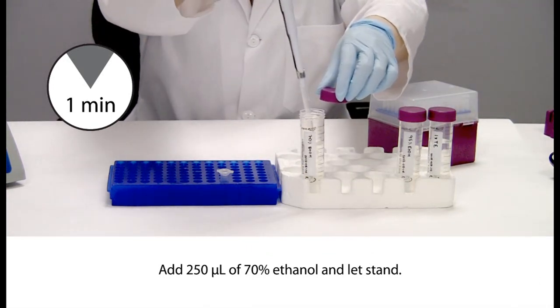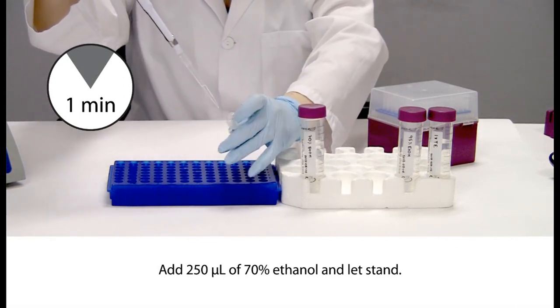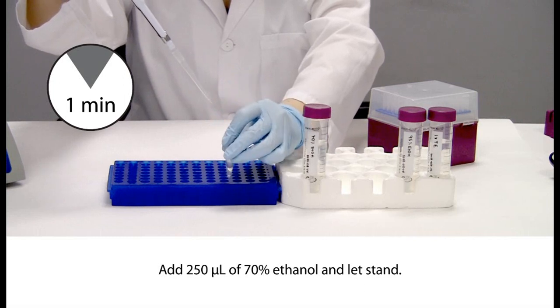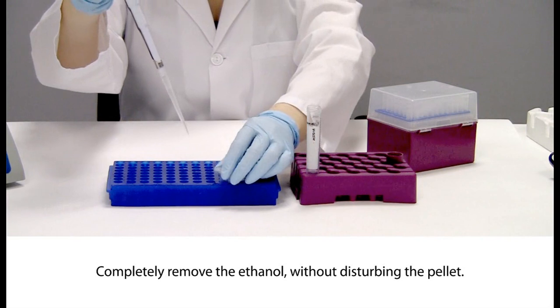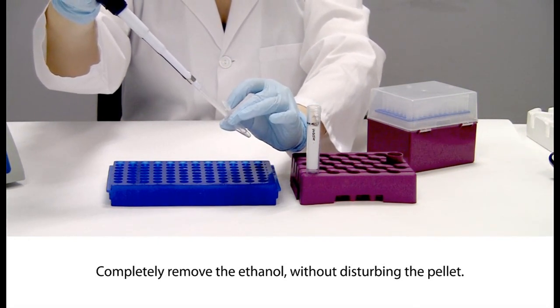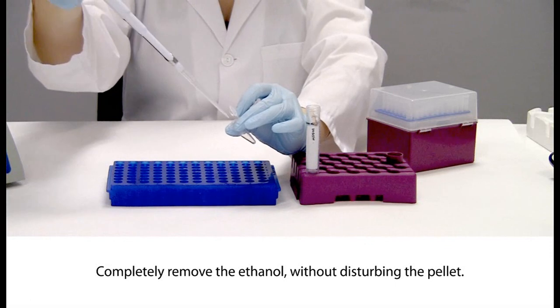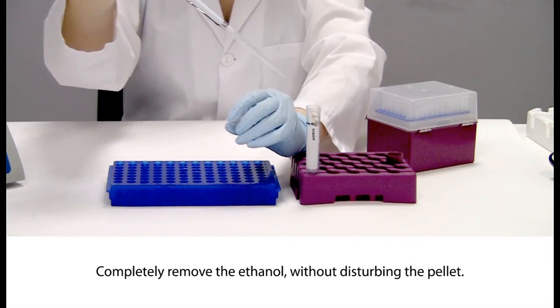Add 250 microliters of 70% ethanol and let stand at room temperature for 1 minute. Completely remove the ethanol without disturbing the pellet. It is important to remove all ethanol from the sample, as carryover of ethanol may impact the performance of the downstream assay. Should the pellet detach, centrifuge the sample for 5 minutes at 15,000 times G.